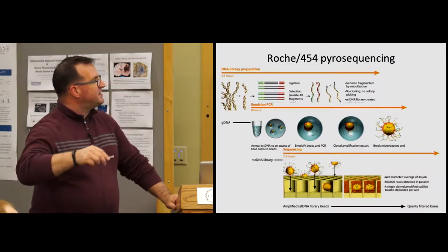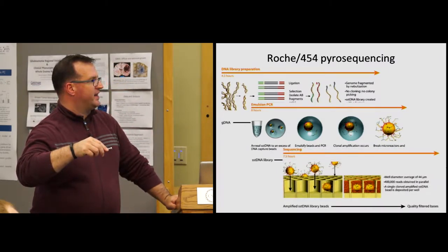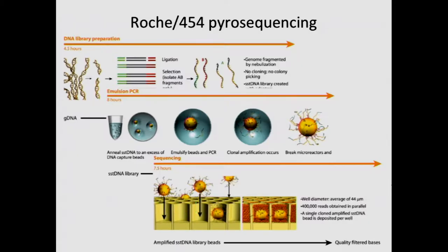Okay. The last step then is to plate these beads out in a nano well plate where each of the wells is only big enough to fit one and only one bead. And this is another process where most of the wells get one bead, some of the wells get zero beads. And once in a while, two beads happen to get stuck into the same well because again, it's not a perfect process. But again, at the end of the day, you have this honeycomb of wells in which you now have, most of the time when things are going well, one bead that's coated with many hundred thousand copies of the same DNA that has been PCR amplified.